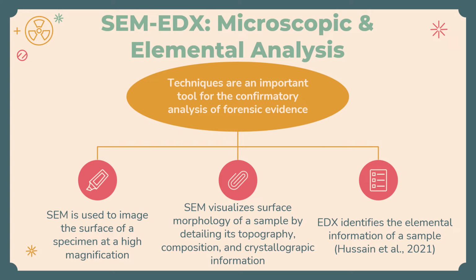The SEM instrument is able to visualize the sample's surface morphology by giving details on its topography, composition, and crystallographic information. Separately, the EDX is an add-on to the SEM instrument and identifies the elemental information of that sample.